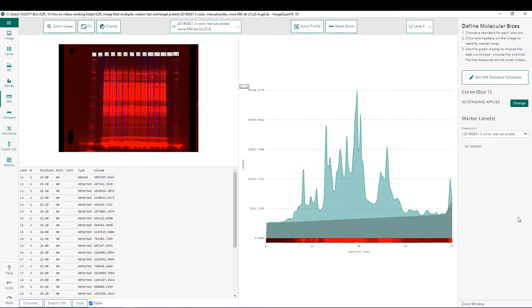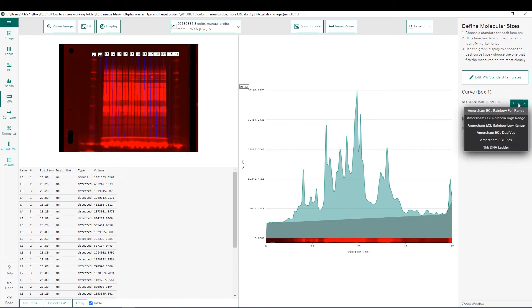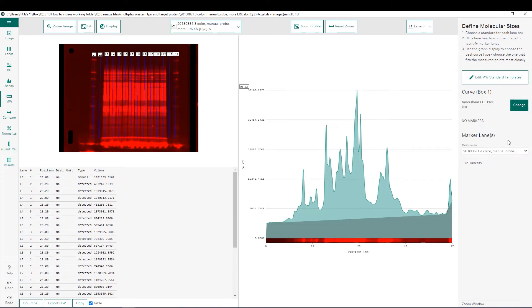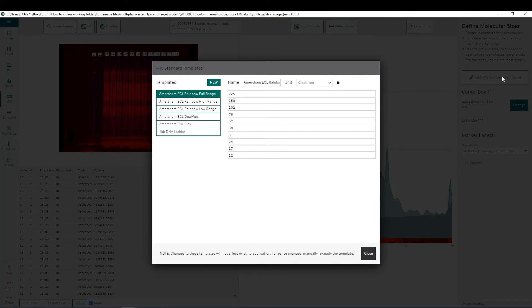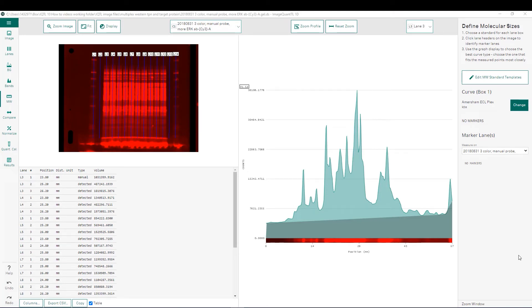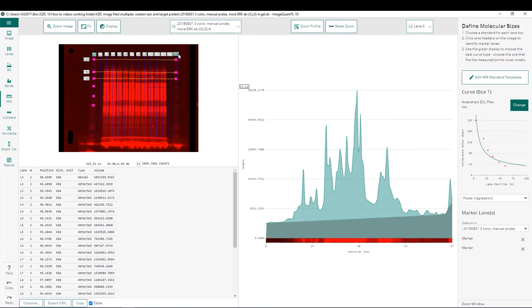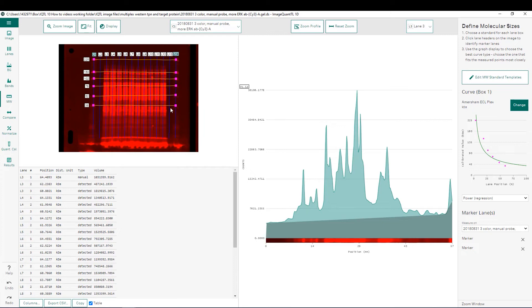Once we've adjusted our contrast, we can choose which molecular weight marker we are using from the list. In our case, we're using the ECL Plex marker. If your marker isn't in the list, you can edit the molecular weight standard templates and add a new template. We can then choose which lanes have our molecular weight markers — in this case, lane one and lane 14. We can then manually add additional bands by clicking on them to make sure they match across different lanes.